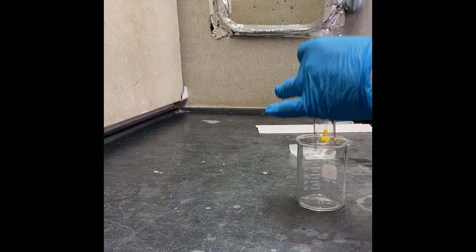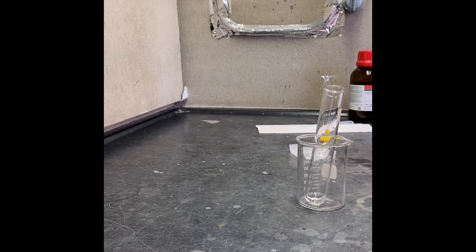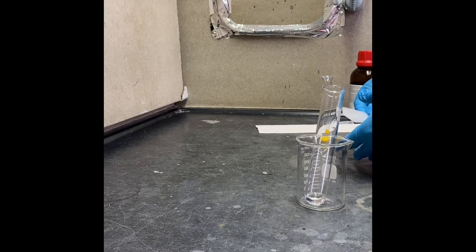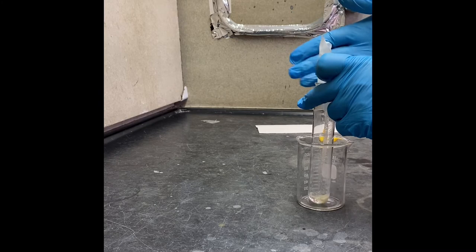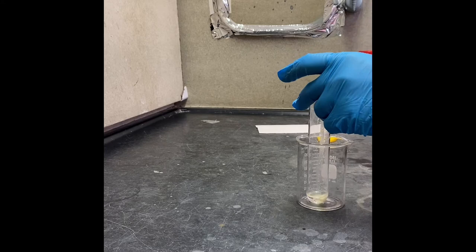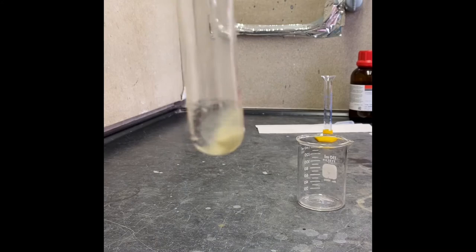And now I'm going to add 0.3900 grams of the crushed potassium hydroxide. That's the initial color.